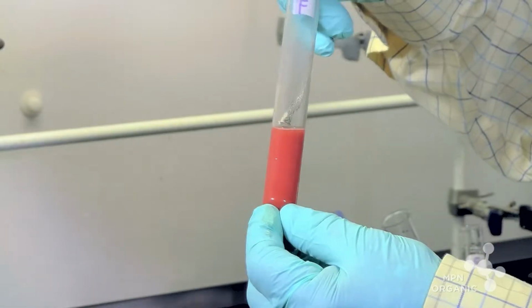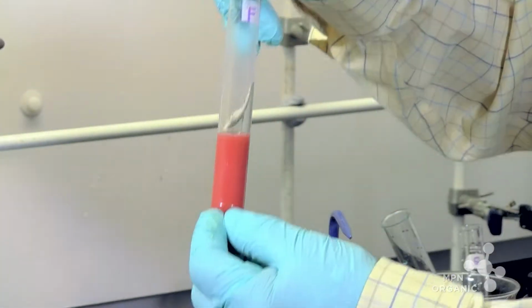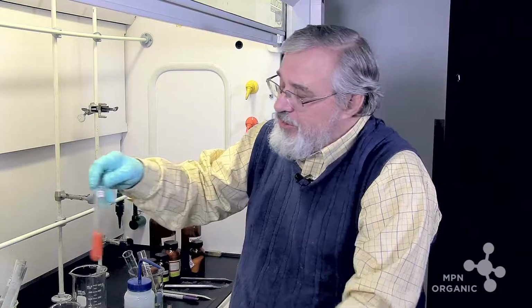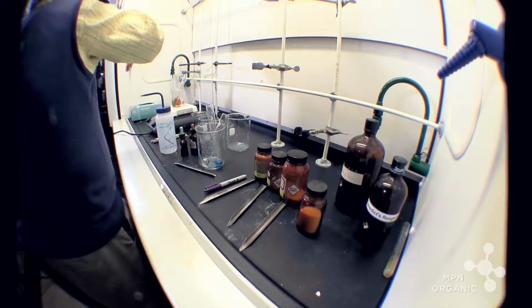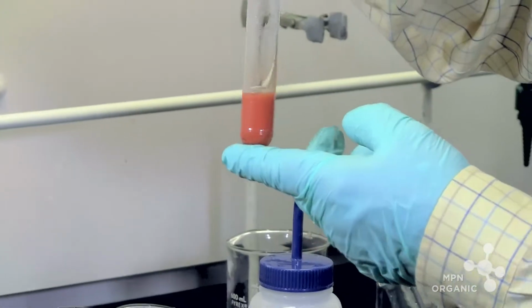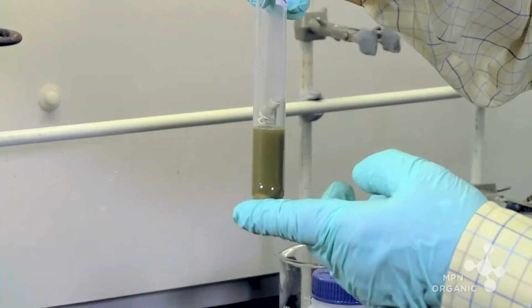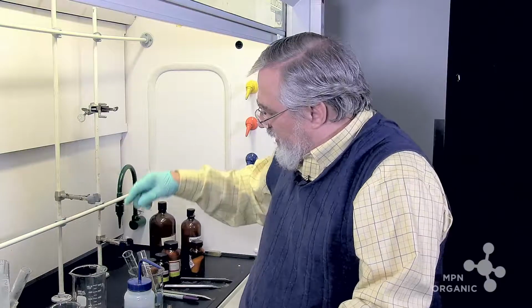And this indicates that fructose has reduced copper 2 to copper 1. Therefore, we call fructose a reducing sugar. You can see here, glucose is almost the same. And it looks as though lactose is trying to catch up.